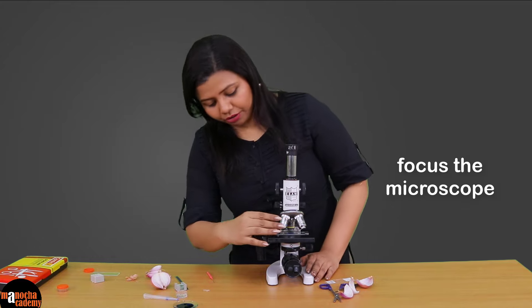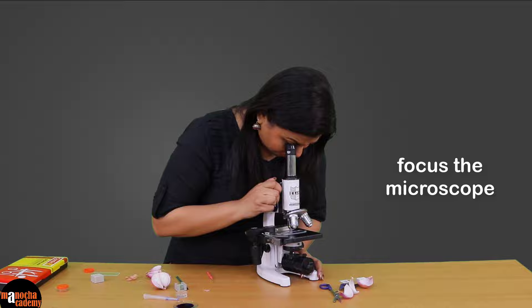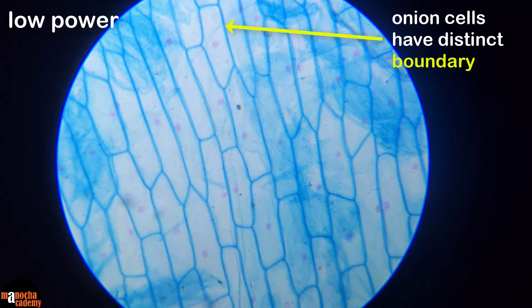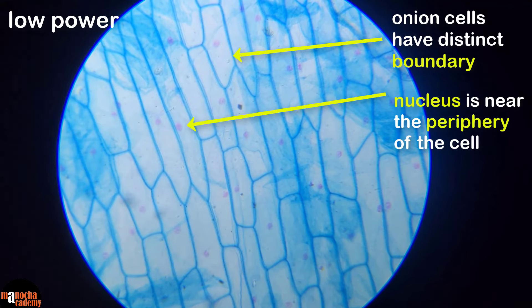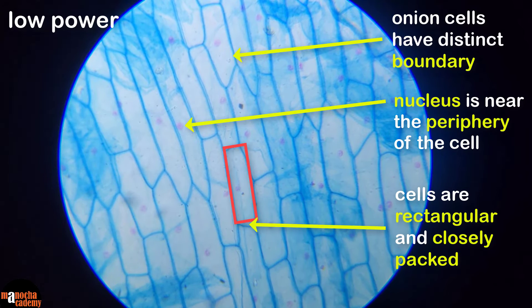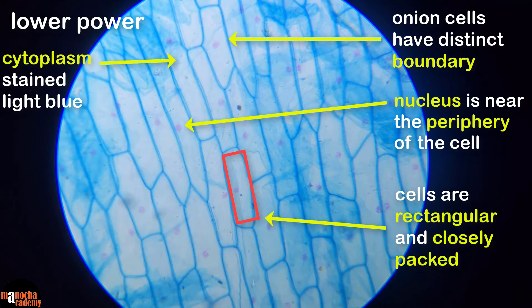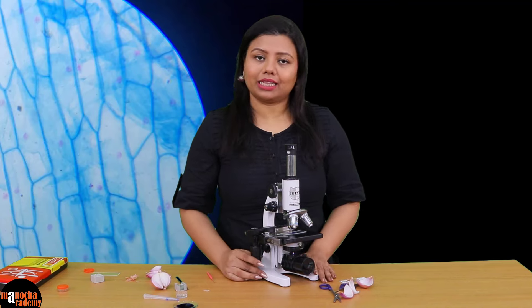I will now focus the microscope at 10x magnification. Here we can see the cells in low power. These cells have a distinct boundary because these are plant cells, so they have a cell wall. They are living cells, and you can see a clear blue dot inside which is the nucleus — the nucleus is located towards the periphery of the cell. The cells are rectangular, brick-like, and absolutely closely packed, as you would expect from an epidermal layer which provides protection with no gaps. The cytoplasm has been stained light blue whereas the nucleus has taken up a dark blue stain.